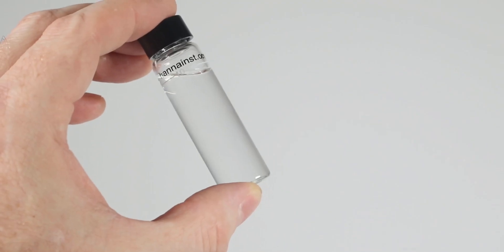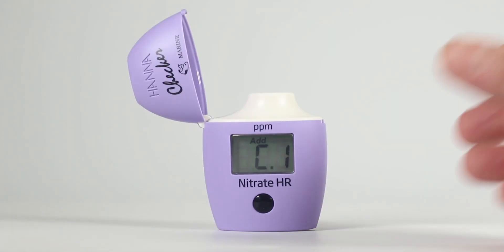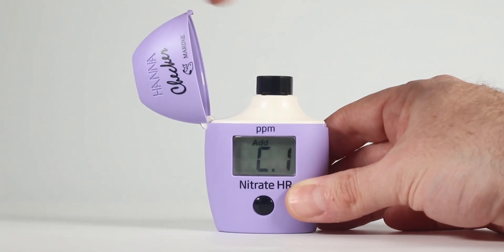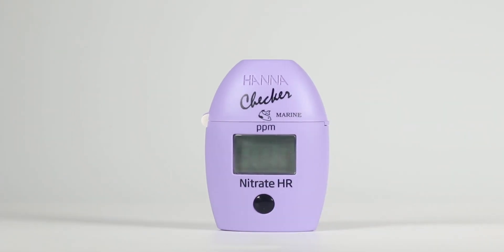We always recommend you wipe down the cuvette before inserting it into the checker. Insert the cuvette into the checker and close the top. Press the on-off button. When the display shows 'add C2' with 'press' blinking, the checker is zeroed.